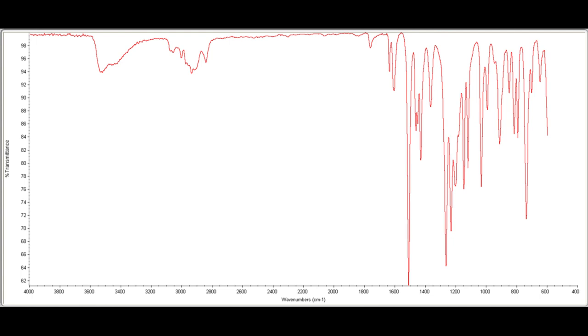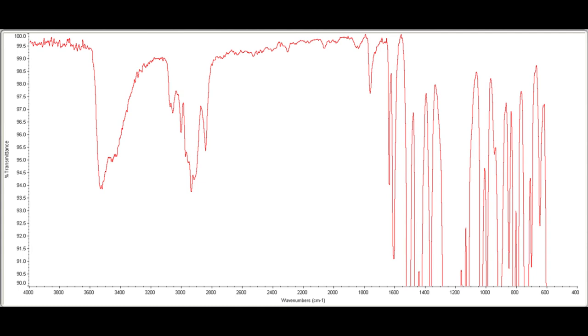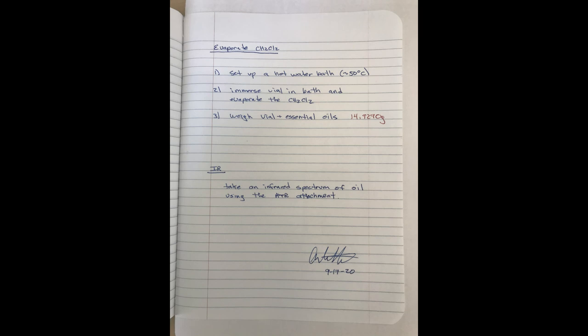This is the final spectra. I've added some grid lines to help identify the wave number for the peaks. I've blown the spectrum up so you can have a better definition of the peaks above 1800 wave numbers. I've also added grid lines to that spectrum. And here is the final notebook page in my lab book.